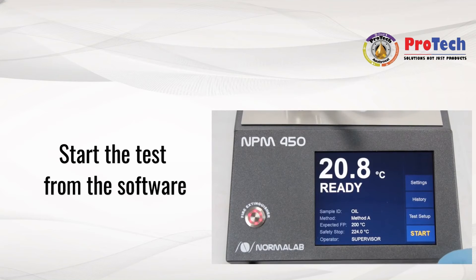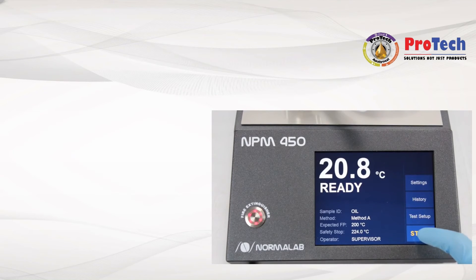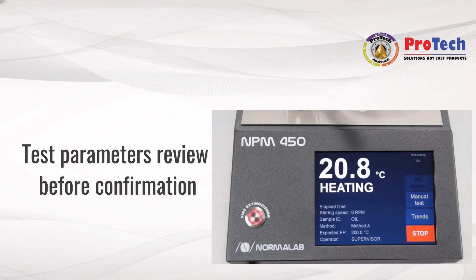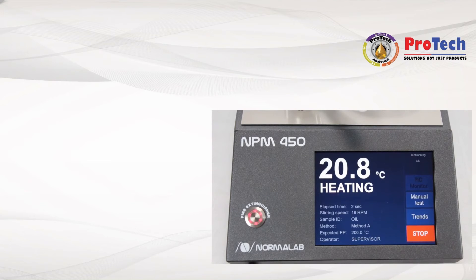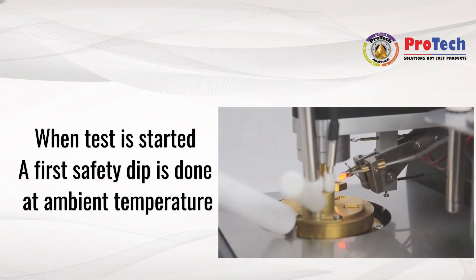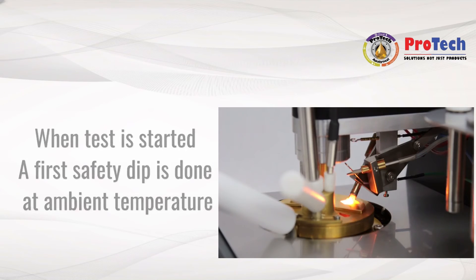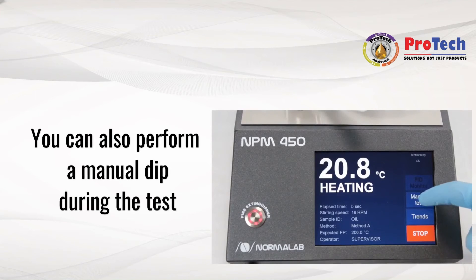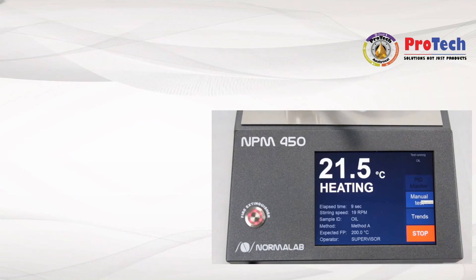Start the test from the software button and confirm the test parameters review. When the test is started, the first safety dip is done at ambient temperature. You can also perform a manual dip during the test using the manual button.